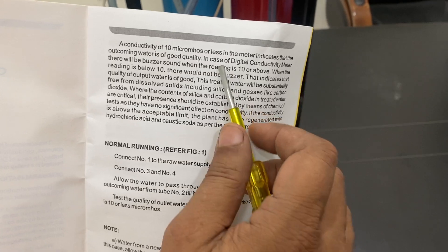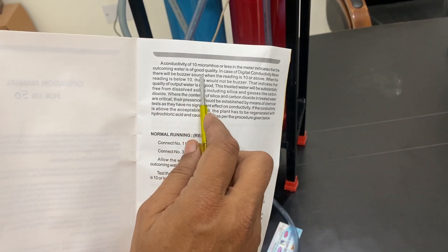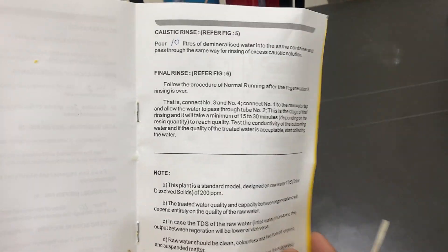When the reading is below 10 microsiemens, the water is very good. For the digital conductivity meter, it will give a buzzer sound. There is another video available online with the full manual.